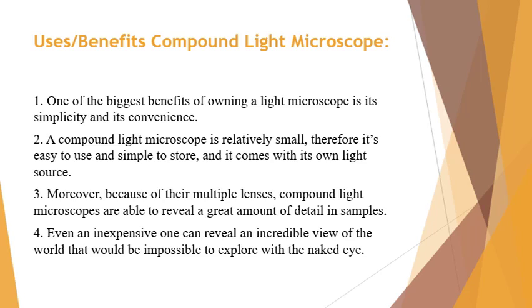In place of a mirror. However, because of their multiple lenses, compound light microscopes are able to reveal a great amount of detail in a sample. And the other benefit of the compound microscope is that even an inexpensive one can reveal an incredible view of the world that would be impossible to explore with the naked eye.